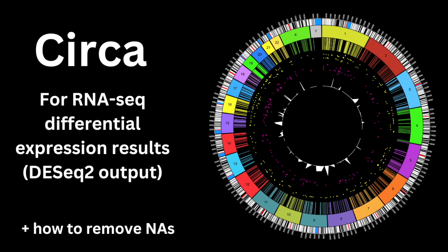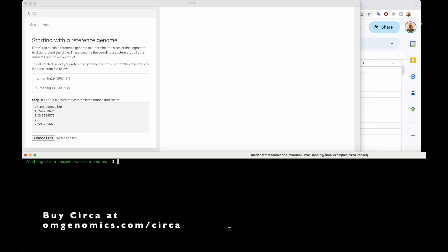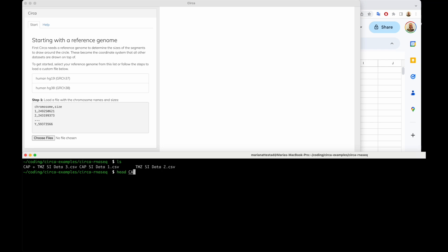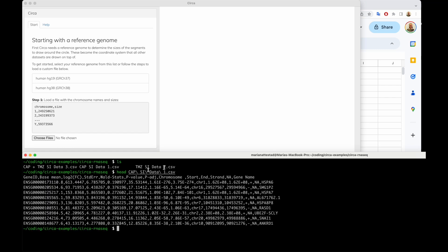This is a short video on how to use CERCA from omgenomics to plot RNA-seq differential expression data from DESeq2, the Bioconductor package in R. We have some data files — let's take a quick look at one of them. This is what it looks like on the inside. Now let's go try to load it into CERCA.